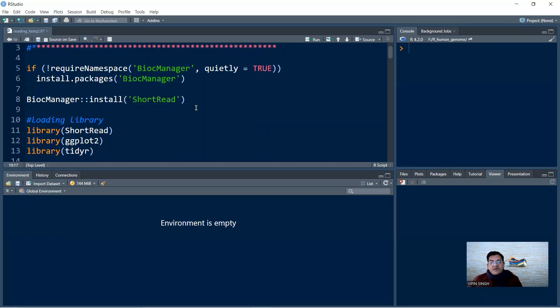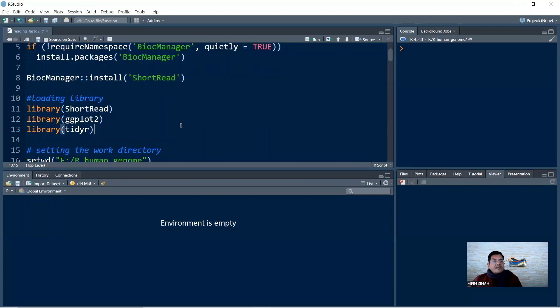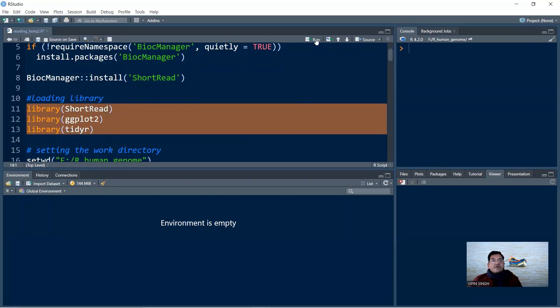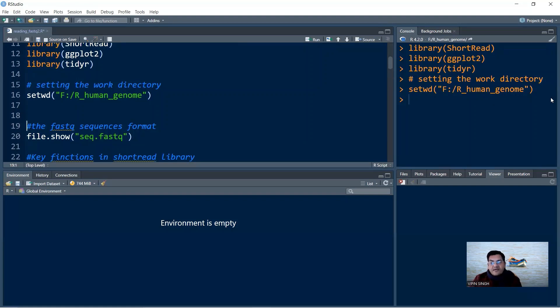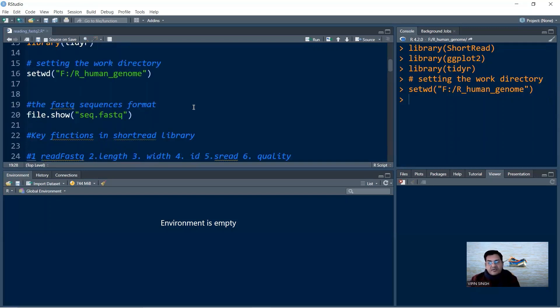After installation, you need to invoke the libraries required by your program. In this case, we use three libraries: library(ShortRead), library(ggplot2), and library(tidyr). Let me run this part so all libraries are loaded. It is also good practice to define your working directory using setwd(), providing the file path where your input file is located — in this case, F:/rHumanGenome. This sets the default folder for reading and writing files.